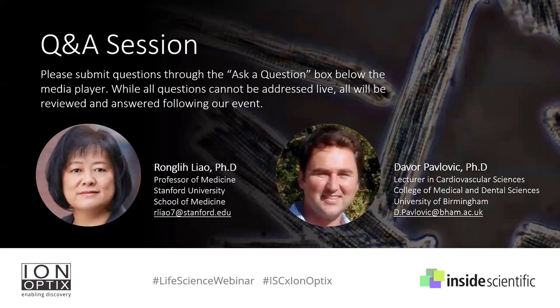Great. And Davor, when you use the Langendorff method, what's your experience with this? So, everything that Rongli said is absolutely right. You need to minimize the time from the chest to the Langendorff system, and the faster that goes, the better. Having used both techniques, injection and the Langendorff, I would probably say this is where the injection technique really has a lot of benefits, because you don't need to cannulate the heart. And the perfusion happens pretty much immediately, essentially even when the heart is still in the chest.